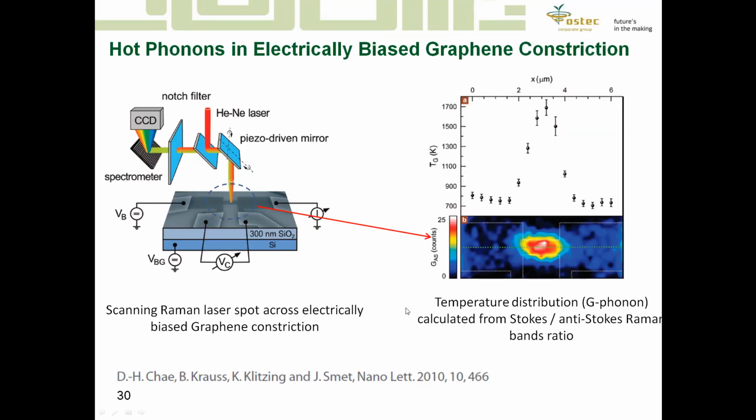And another application you can see here is identifying the temperature of structures on the surface. In this case, we know that the population of energy levels is defined by the temperature of the structure, and the higher the temperature, the more equal the population of higher and lower energy levels.